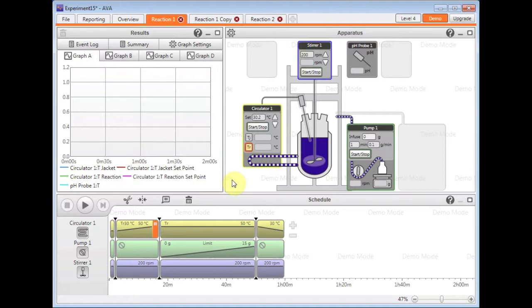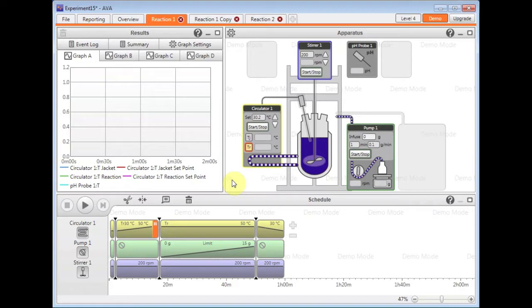So this was just a general introduction to the AVA software and its features. I hope you found it useful. We do have many other video tutorials which explain everything in detail from setting up your apparatus to your complex schedules with the advanced safety features, which I've briefly touched upon.